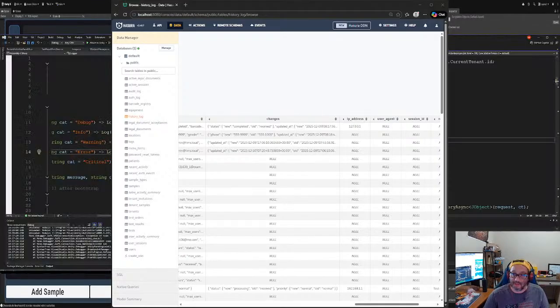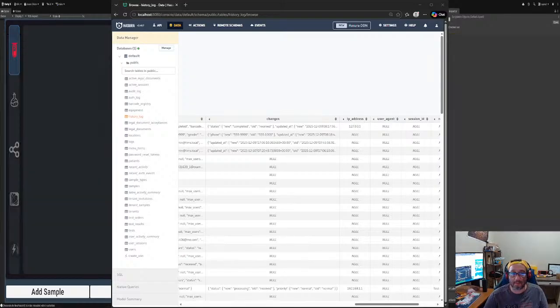Make sure I made the changes. Save all. Pressed the wrong button. Save all. All right.